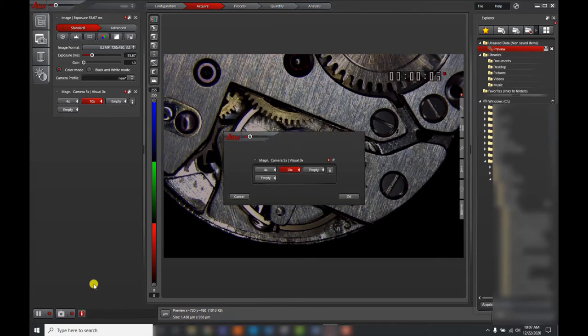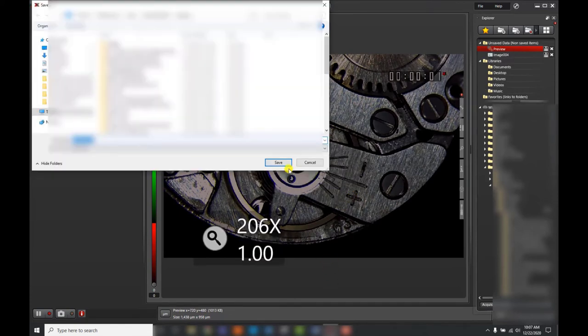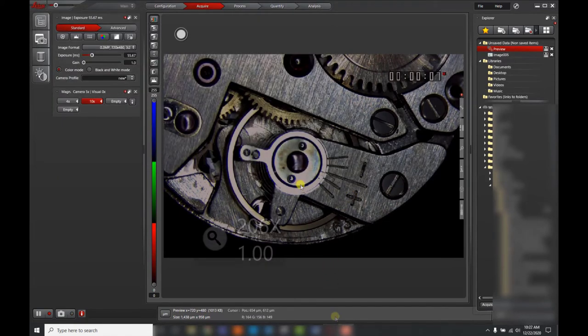On a manual microscope, by default, the software is set up to always ask you what magnification you are using to capture the image. This ensures that the pixels have been properly calibrated, enabling you to perform distance measurements or add scale bars. It also prompts you to give the image a user-defined image name. Both of these automatic features can be deactivated if you prefer.